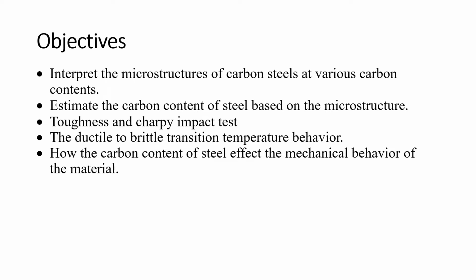You'll learn about toughness and how to use the Charpy impact test to measure it. You'll also learn the ductile to brittle transition temperature behavior, and how the carbon content affects this behavior and other mechanical behavior of the material.